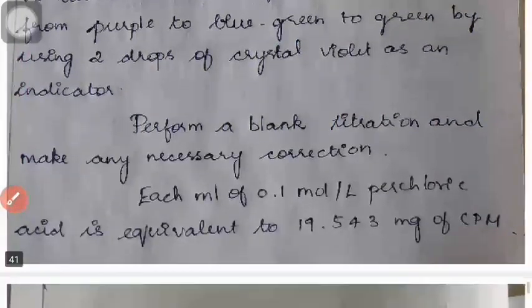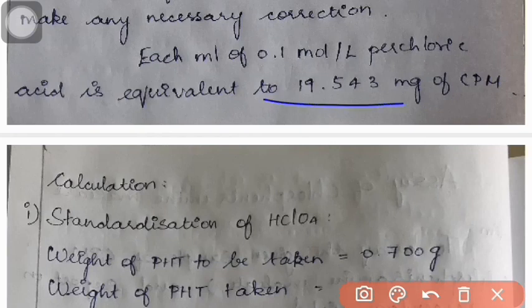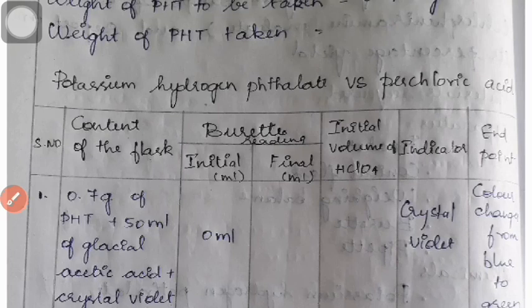So this is the procedure, and the equivalent factor is 19.543 milligrams of chlorpheniramine maleate is equivalent to 1 ml of 0.1 molar perchloric acid. So the calculation we have to make, and the tabular column is like this.